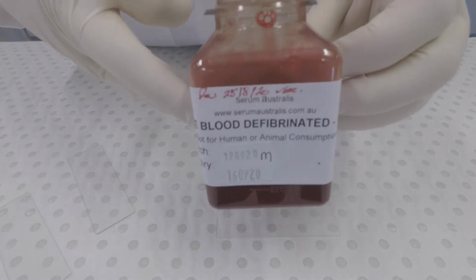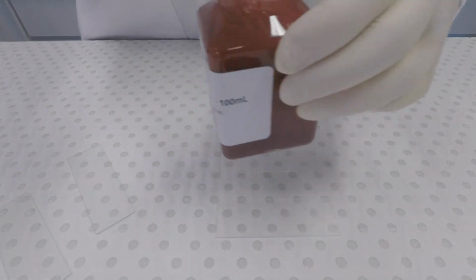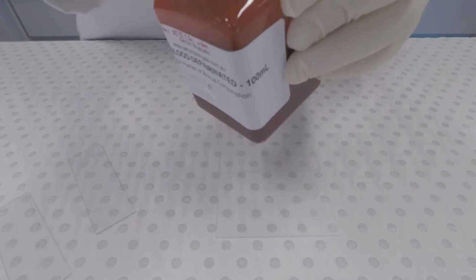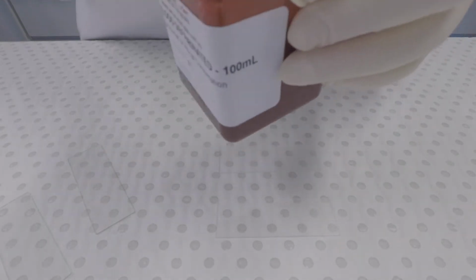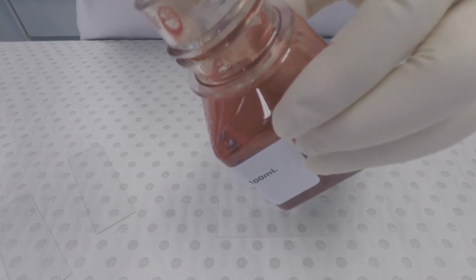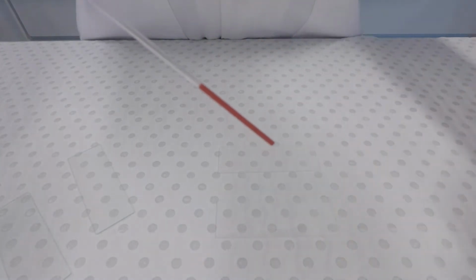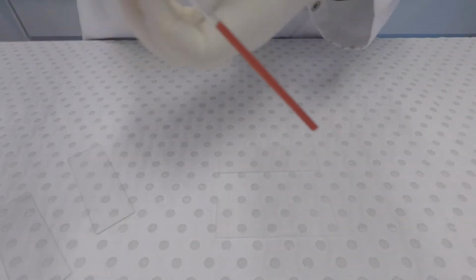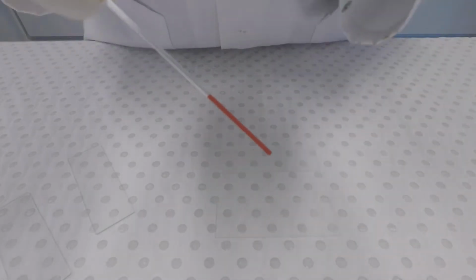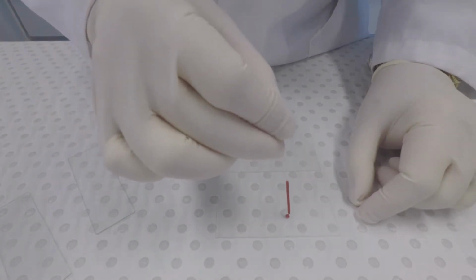Today we're just using a commercially available sample of blood. We'll gently mix it to ensure that it's homogeneous prior to taking our sample out. So as you can see, the blood has been drawn up into the capillary tube by capillary action. We'll then be able to drop one small drop of blood on the slide.